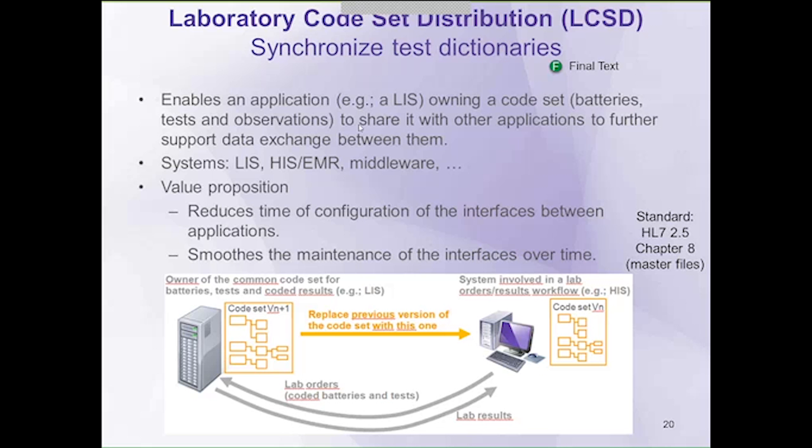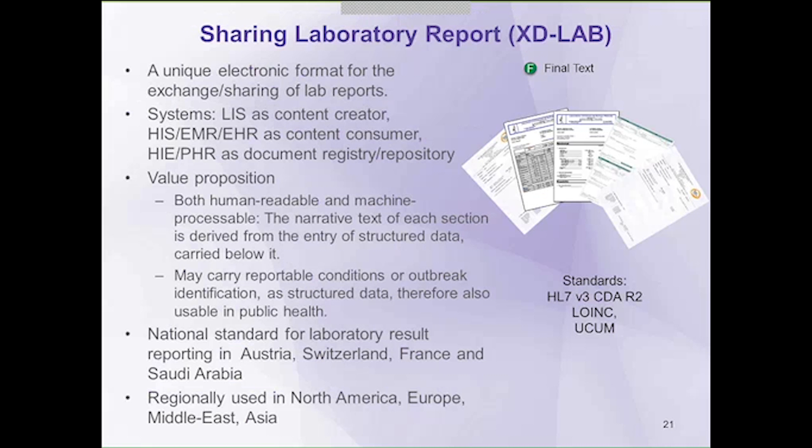The lab can share that data through this standard, and it's again using version 2.5 master files as the basis, together with some vocabulary standards like LOINC and SNOMED. And then sharing laboratory reports.